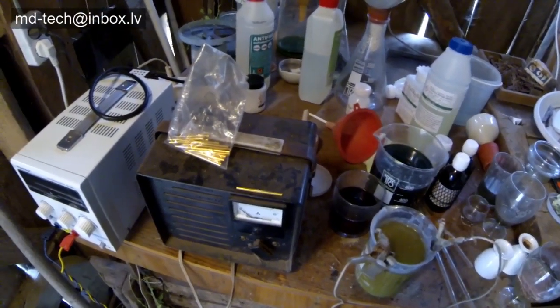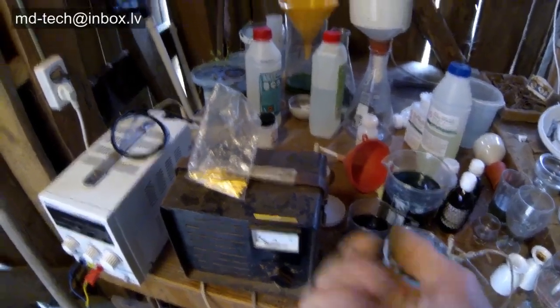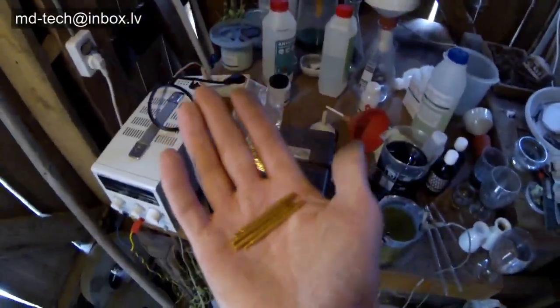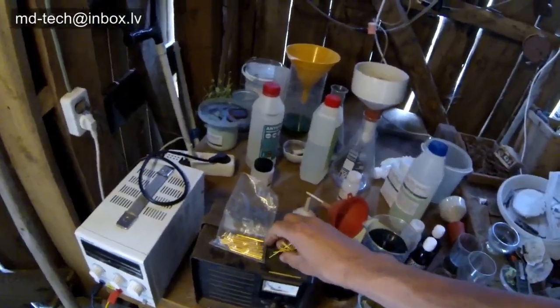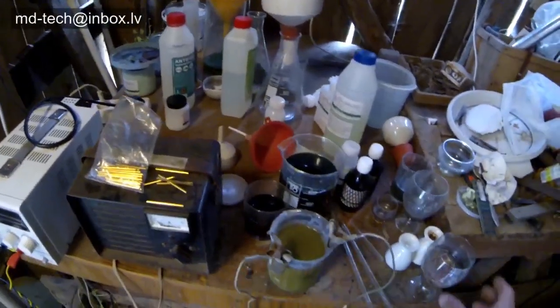Hello friends! In my old archive I found a video from about 10 years ago when my lab was very ugly. In this video you see an old battery charger and some gold-plated pins.